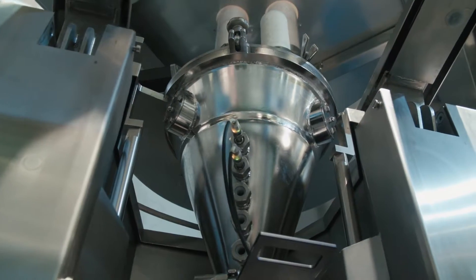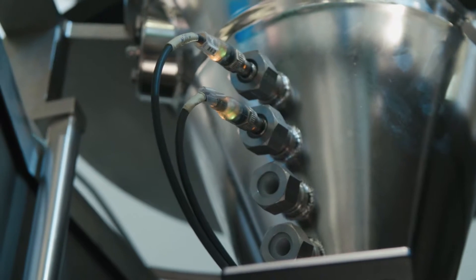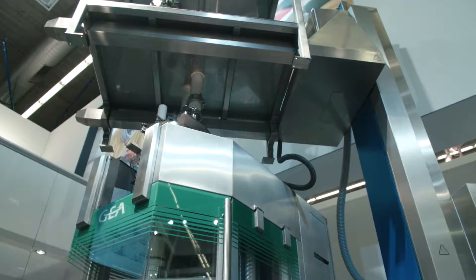The segregation we have eliminated by designing a continuous system — a continuous dosing, blending, feeding, and tableting system. Like that, we have eliminated all the process steps which increase the risk of segregation of the blends.